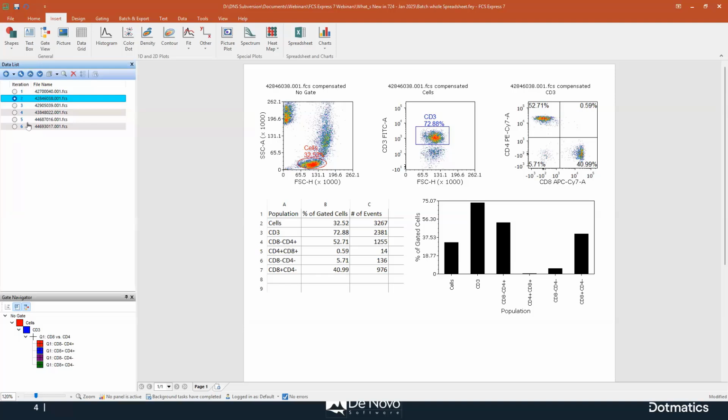We already saw that the addition of this small item really makes it clear that you can click on an iteration to load it. So again, it's a graphically small announcement, but we saw that it's really effective for new users to clearly understand and see that this is a clickable item. So it improved the affordance of that button.